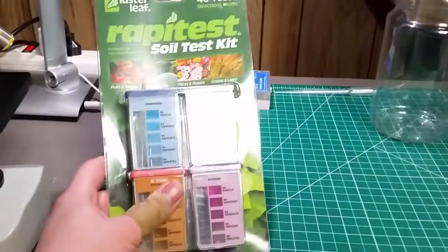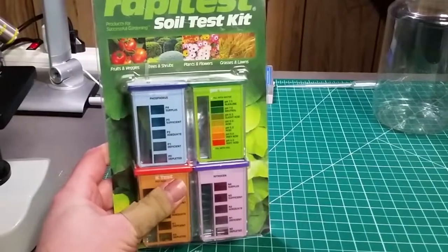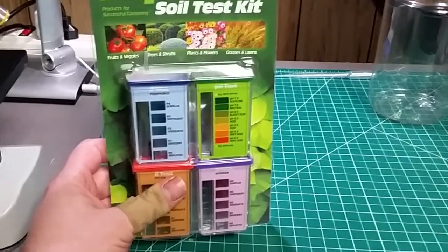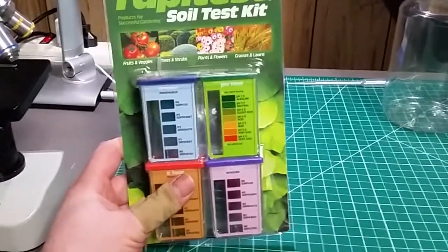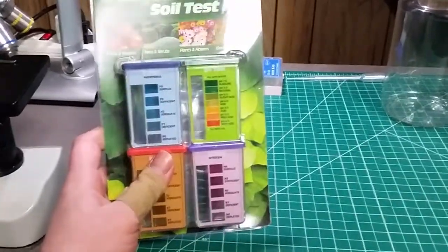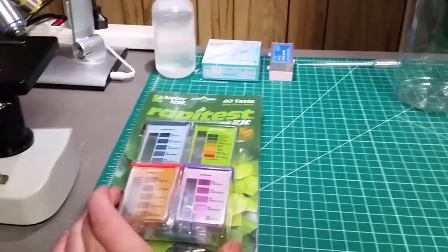We've got the test that doesn't really matter much, which will give us pH and NPK. This is only going to tell us information about what's currently water-soluble in our sample. It's not going to tell us anything about the soil's capacity, or the microbes and other microscopic life in there that will release water-soluble chemicals once the plant's in there.